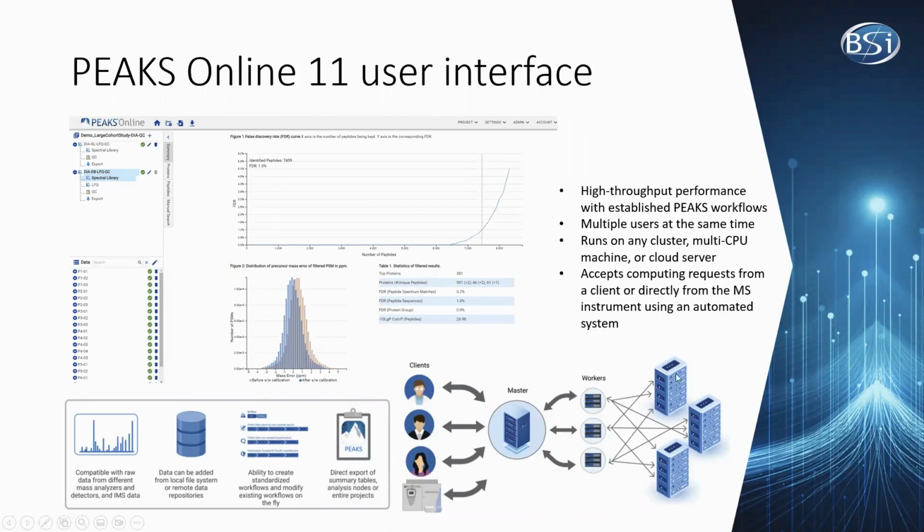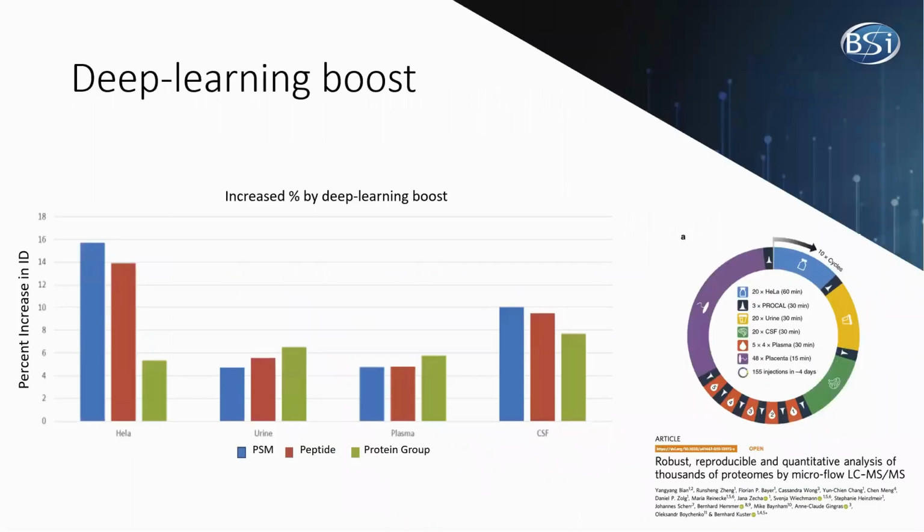It's 202 because I wrote the sequence 201. Okay. In any case, I won't use that one.